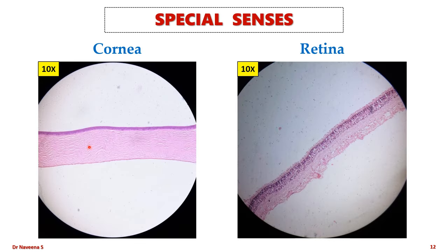Here are the two slides from special senses. Cornea can be identified by regularly arranged collagen fibers covered by stratified squamous non-keratinized epithelium. Retina can be identified by the presence of 10 layers with nuclear layers and a single cellular ganglion cell layer.